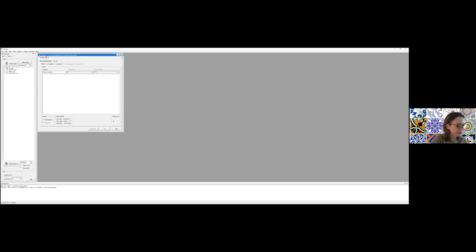I'm just going to have my step-by-step guide here so that I follow more or less the same steps as what I'm going to tell you in the guide. This is LINXS data. And I'm going to assume that you don't have the PDB structure available, which is often the case when you're looking at a new structure. But let's say that we expect it to be sort of an ellipsoid shape, so not a perfect circular shape, but an ellipsoid. So we choose ellipsoid. Now SASView has a number of models already loaded onto it, so you can at least do a first approximation. You can load these to see how it fits your data.